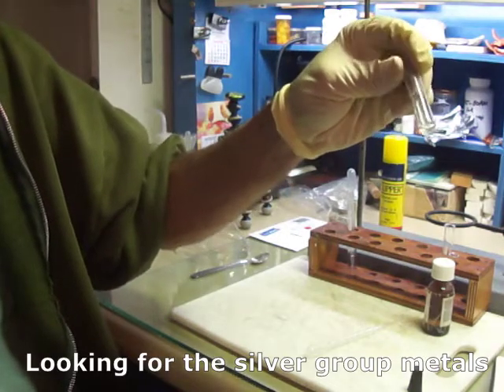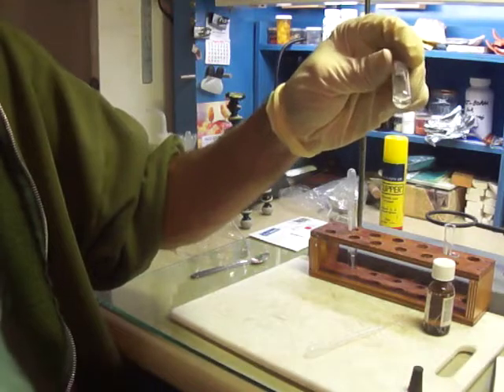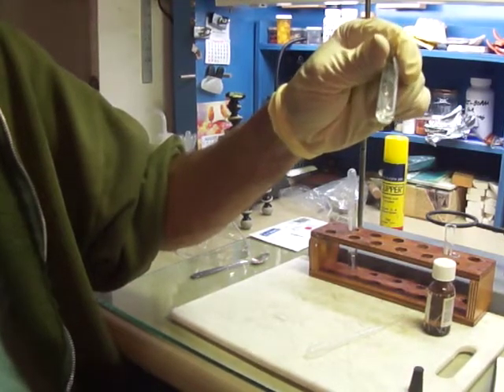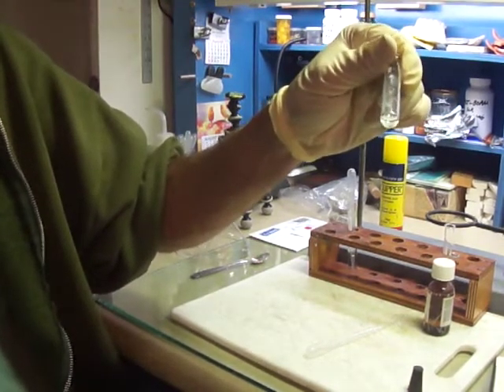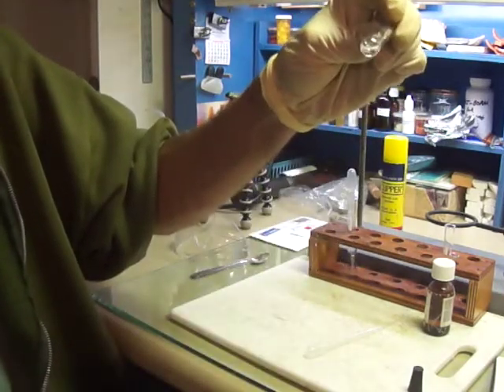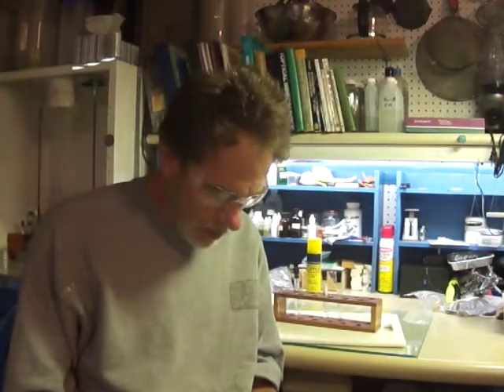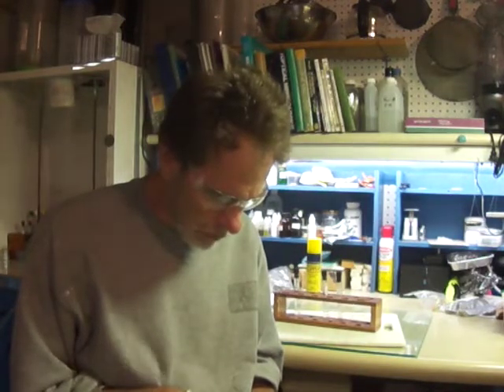So adding the chloride would precipitate out the silver group with all the insoluble chlorides of silver, mercury, and lead. But there's no precipitate, so we can rule out silver, mercury, and lead. Now we're ready to try to precipitate out the copper and arsenic groups, as they are called in this reference.